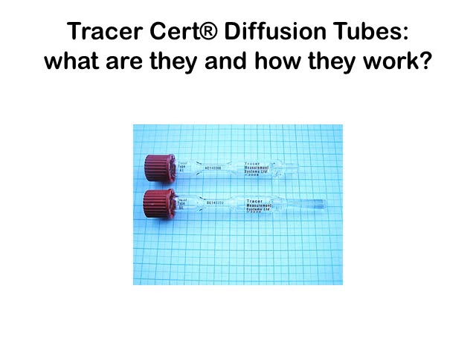When used at a set temperature in such an oven, the vapour of the compound is emitted at a steady rate, which is determined by the properties of that compound, by the set temperature, and by the particular dimensions of the diffusion tube used. The higher the temperature used, the greater the rate of diffusion of vapour out of the tube. The vapour diffuses out into a flow of carrier gas. The larger the gas flow used, the greater the dilution of the vapour, and the smaller will be the concentration obtained.